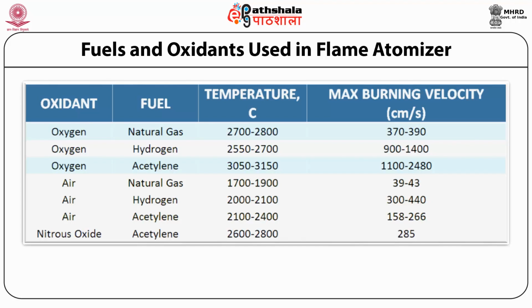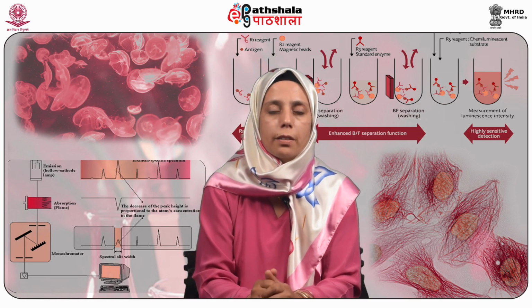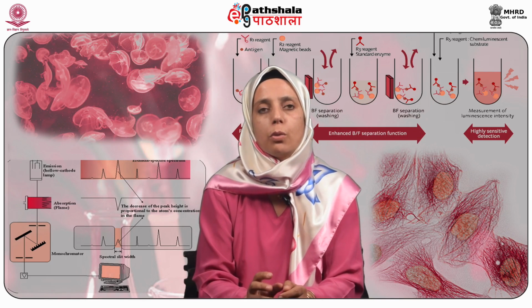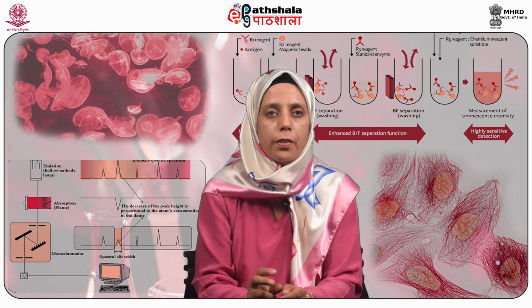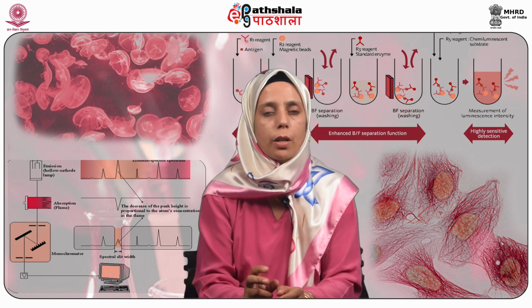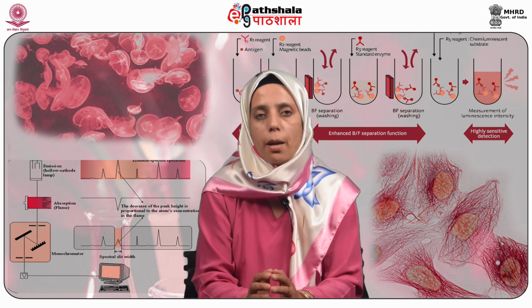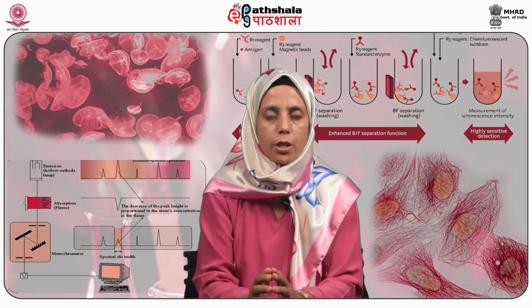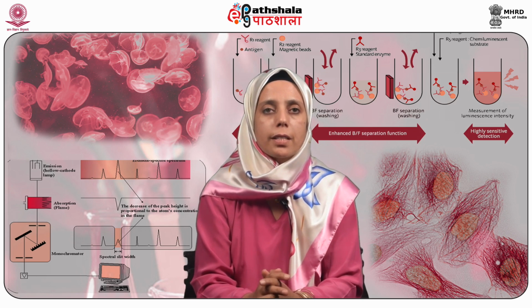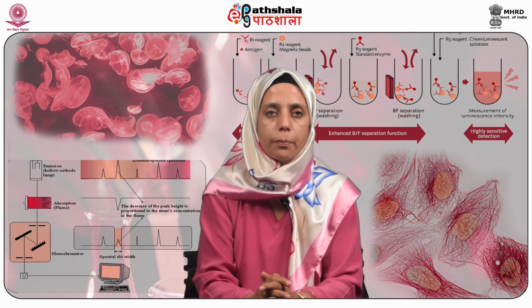Now it is very important to select a wavelength. Why? We know that the difference between the two energy levels is very definite. Therefore, a wavelength which has specific energy related to it should be supplied so that molecules absorb that amount of radiation and no noise is produced. So wavelength selectors limit the radiation absorbed by a sample to a certain wavelength.